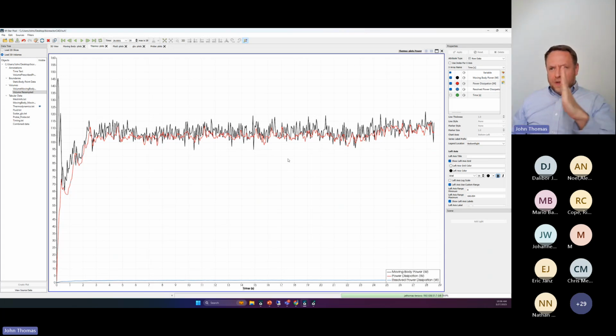And as long as you're, and I've spoken about this at length in our previous webinars, you can look at them. When I talked about DNS, LES simulation, what it was called, DNS CFD on GPUs or whatnot. It was last December, I think. But foundationally, as that filter gets small enough and that resolution gets small enough to be smaller than the Taylor scale, the simulation is going to work great, because that point is doing what it was designed to do: mop up rapidly thermalizing eddies as they go down into the Kolmogorov dumpster.